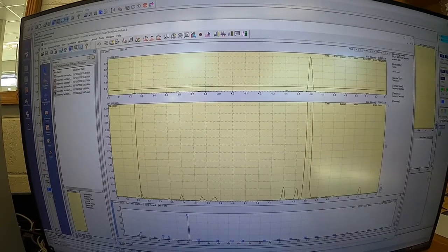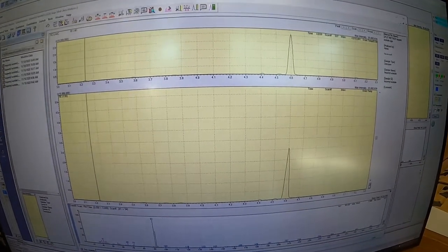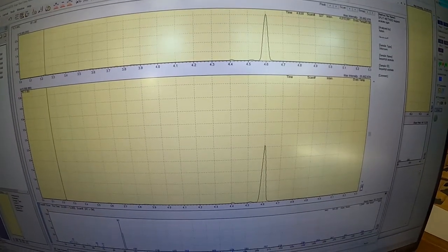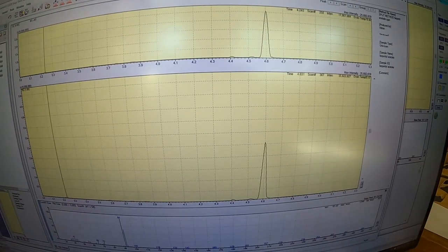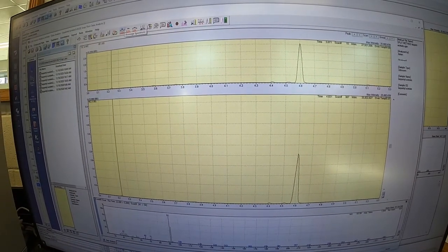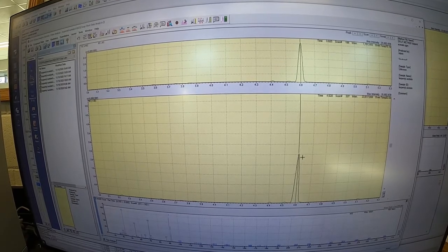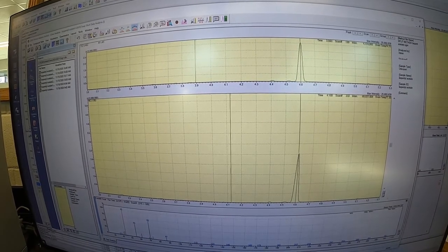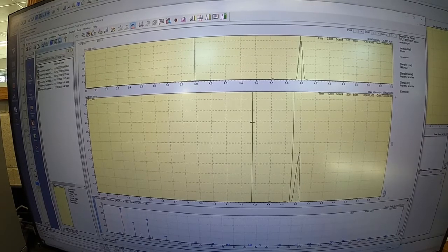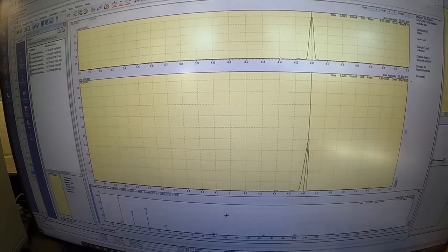The important one, if I unzoom now and focus on just my one big peak in the middle of the screen there, and again I can say in the software I want to look at just the positive ion fragments. I'm going to select that whole peak. I can also subtract out some of the background to make it more accurate. And now I go back down here to the mass spectrum.